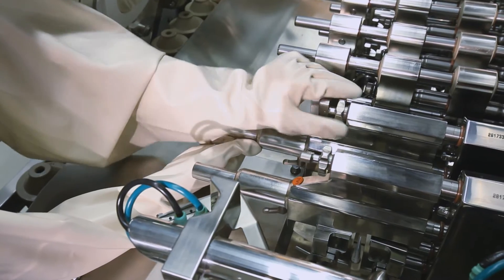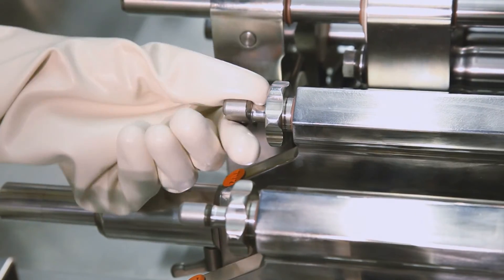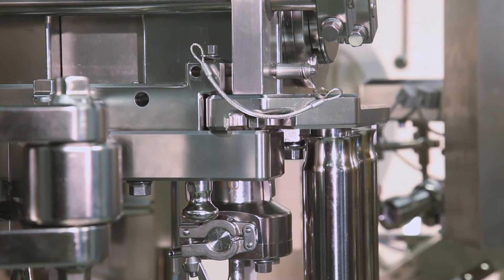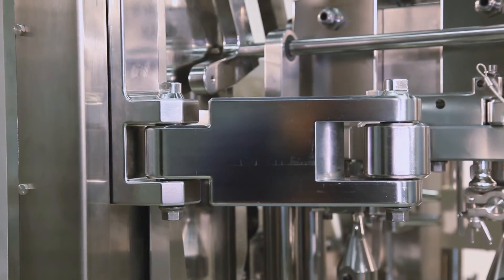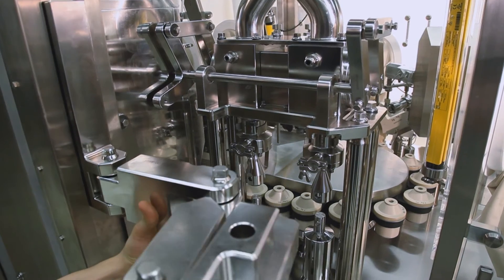The user-friendly adjustment points allow an easy and quick setup of the machine. The whole filling system can be swung out of the machine for offline cleaning. The time to take out a used system and put in a cleaned system is less than 10 minutes.